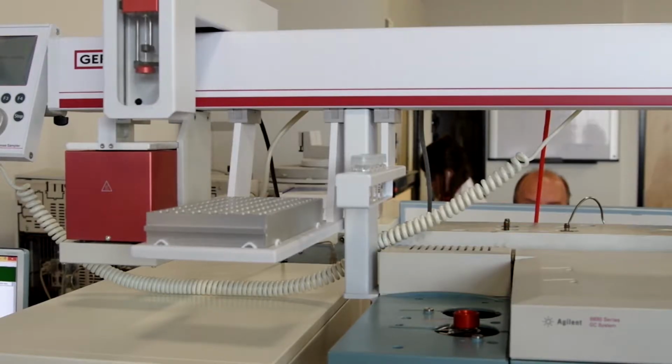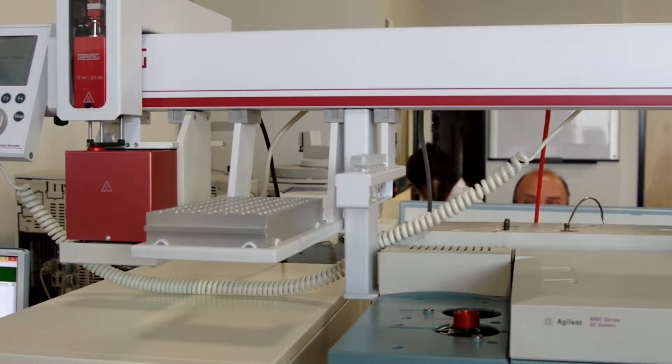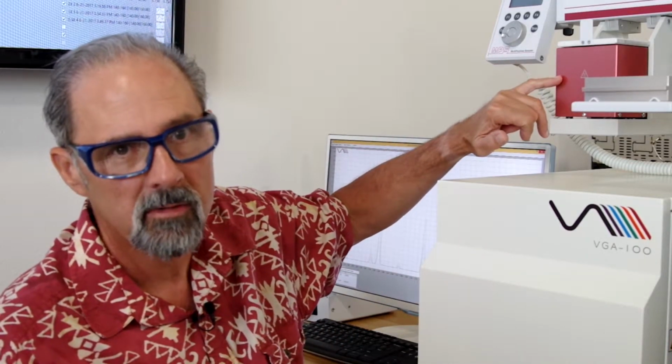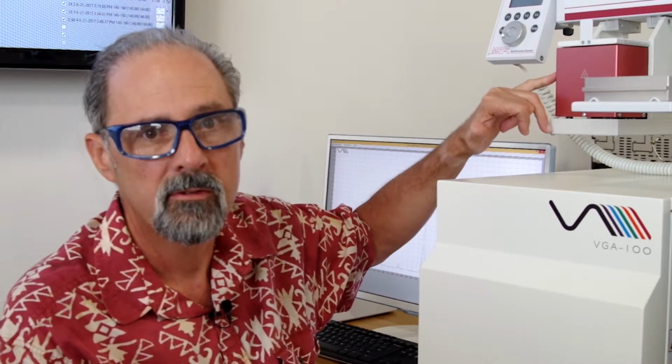Finally, you can't do any of this without having a very powerful static headspace autosampler. And we rely on the Gerstel MPS2 in our case, and that actually helps with the analytical throughput also. One of the ways it does this is we have a mixing box here, an incubation box, that provides heat and a stirring action.